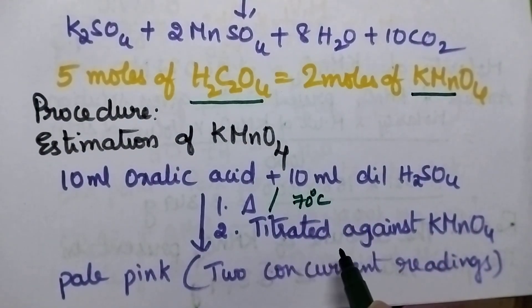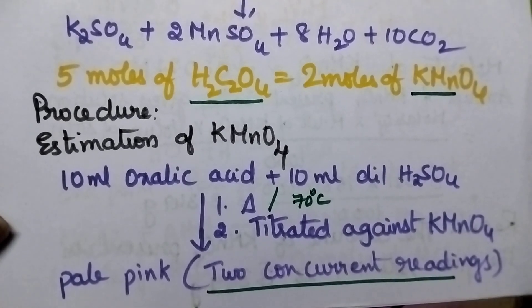In the hot condition, it is titrated against KMnO4 solution until the colorless solution changes to pale pink color. The same titration is repeated until 2 concurrent readings are obtained.